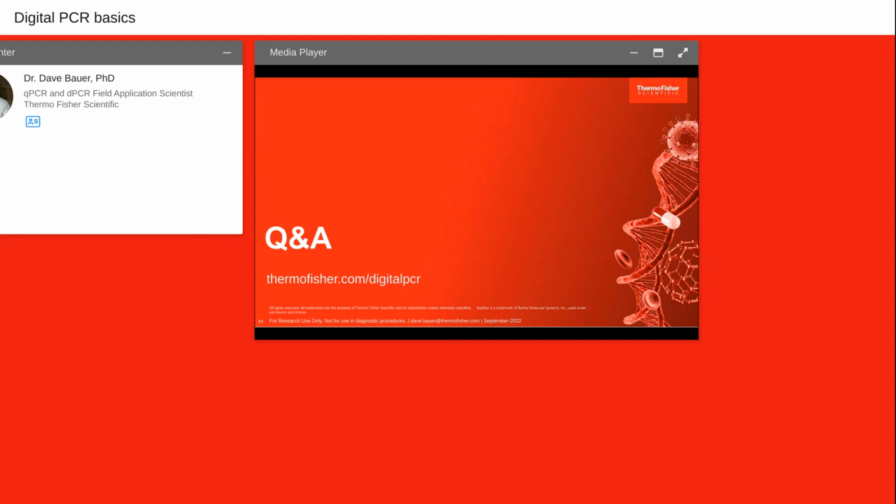All right, great, thank you. And your last question today, what is dead volume and why is it important for digital PCR?